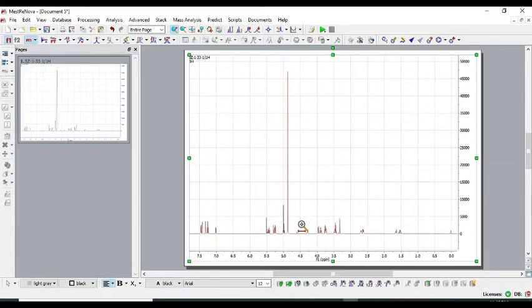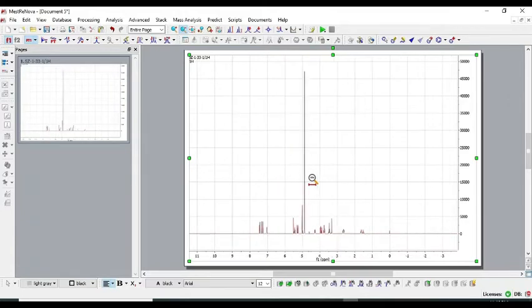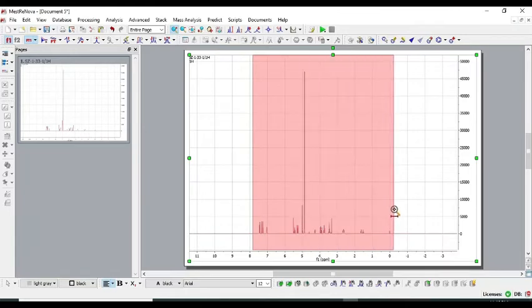then leave it. So now you can see that your spectrum, or the whole screen, shows the spectrum from 0 ppm to about 7.5 or 8 ppm. If you still want to go back to the original position, you can zoom out, and when you click on zoom out and you click in the center of this page, you see it's zoomed out. So you don't want that, you go back and zoom in. You can actually drag it from left as well, like this.